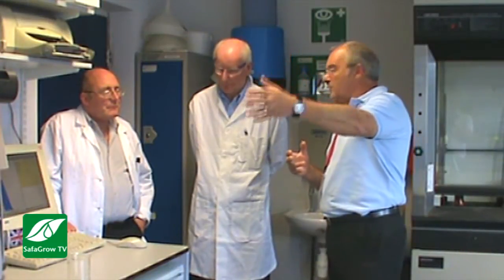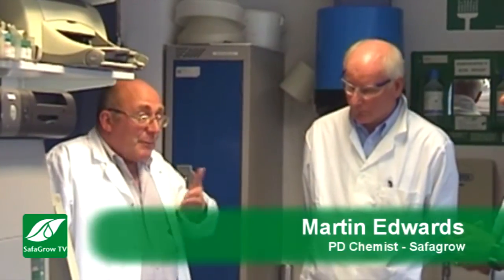Now, one of the things that interests me, apart from that, I see you've got apparatus here, I think that's chromatography over there. This one here is to do with analysing for particle size. Yes, correct. Why should we want to do that? Well, the smaller the particle is, basically the easier it is to suspend in the water phase, so they'll stay suspended longer.